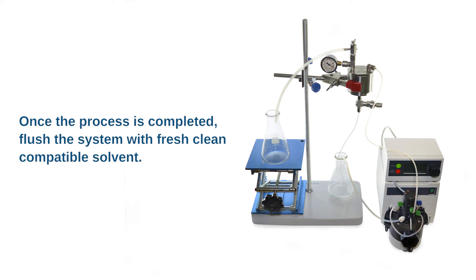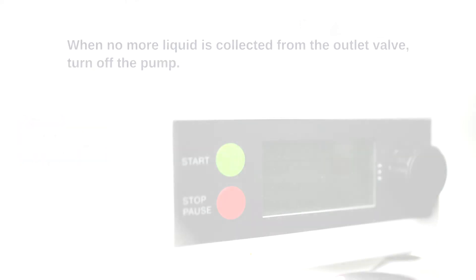Once the process is completed, flush the system with fresh, clean, compatible solvent. When no more liquid is collected from the outlet valve, turn off the pump.